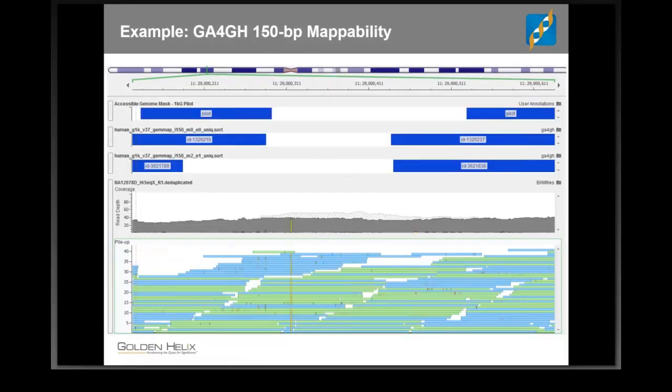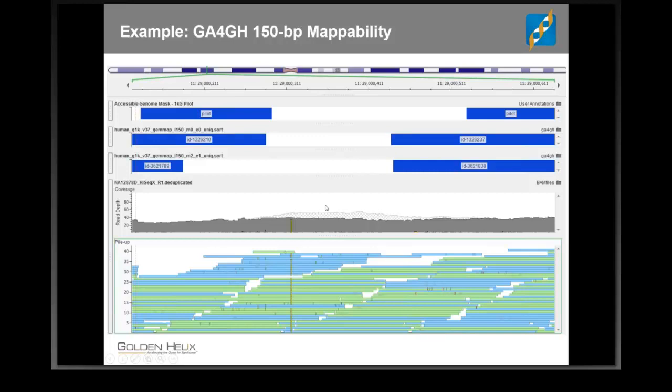Now just to show two quick examples of this, I mentioned the low complexity regions annotation from 1000 Genomes Project. Here we see in the reference sequence a dinucleotide repeat. We also see a homopolymer out here to the right. And you can see in this BAM file with this sequence alignment pileup, a lot of confusion going on in that area. Some aligners will handle this better than others. But if, for example, this position had been called as an AC heterozygote, I would be very concerned about whether or not that was a real variant. One more example. In this image we see up here in blue on the first line the accessible genome definition according to the 1000 Genomes Project. And we see a gap here where they say this region is not accessible. Then just below we see from GA4GH the regions that are accessible for 150 base read length, which is what we have in this particular image. And again there's a gap there. And we see in the Genome Browse pileup this crosshashing, which indicates the presence of multi-mapped reads. It means we have many sequences that are aligned here but could align elsewhere.